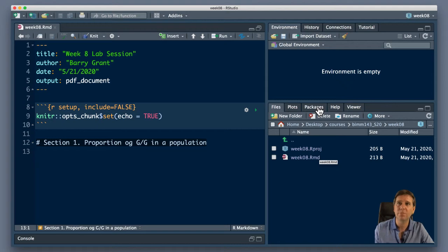Now, I don't have any content in here yet, but I need to go and read that file that I downloaded. So I can either move that file into the project directory, which is probably a good idea to do, or I could try and read it directly from my downloads folder. Let's move it into this project directory.